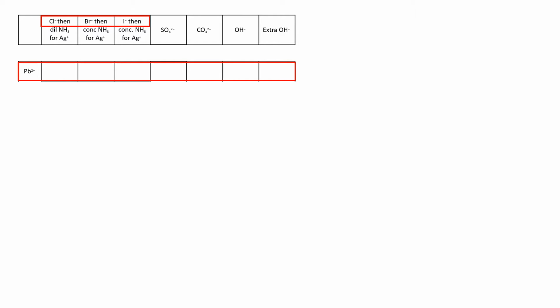But anyway, let's take some lead and we're going to add various ions to it. The lead is in the form of lead nitrate. Anytime you see a nitrate, you know it's going to be water soluble. So lead nitrate, no problem. Nitrate ions floating around as spectator ions, lead 2+ ions floating around. We're going to try first of all adding some magnesium chloride to that.